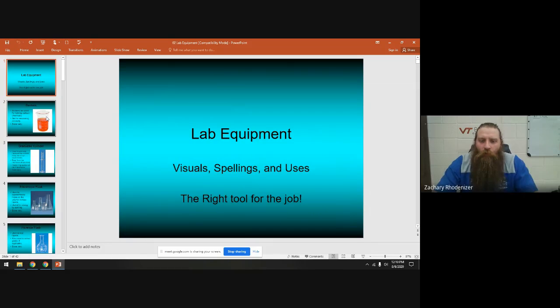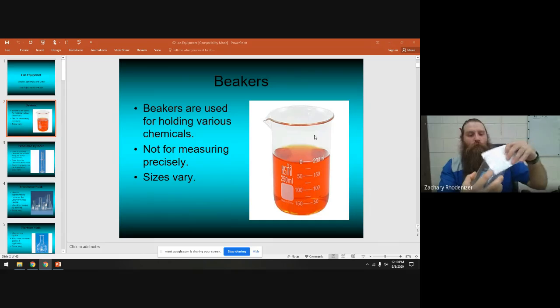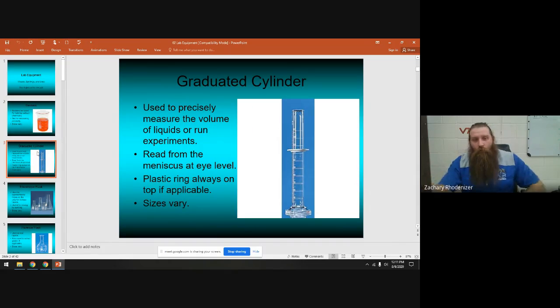The big goal here is to use the right tool for the job. First: beakers. Beakers are used for holding various chemicals — they're not for measuring things. On the side of this beaker you can see it says plus or minus five percent, so if you put 100 milliliters in you might have 105 or 95 — you don't know. Beakers are not for accurately measuring; they're for holding chemicals, stirring, mixing, and heating.